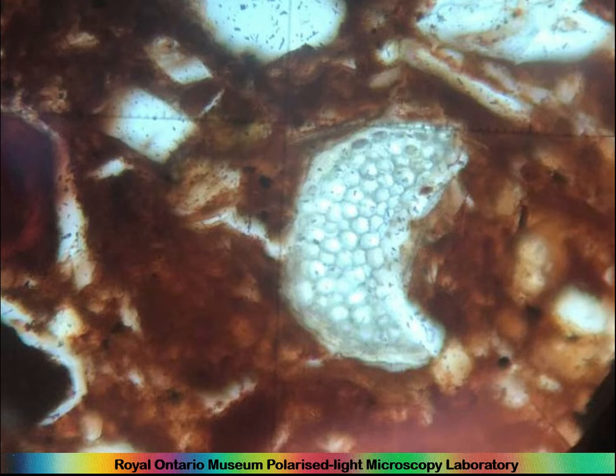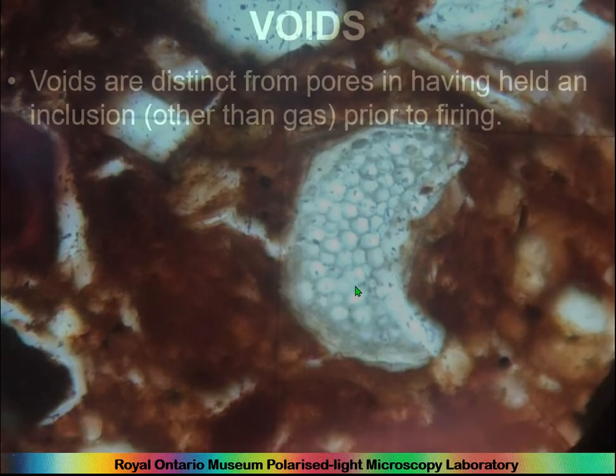You do get these phytoliths in other parts of the world, like in southern Iraq, where there's a lot of reeds, but you get a lot of it in the Nile. So it's again very distinctive, but it mostly tells you that this comes from a river somewhere.